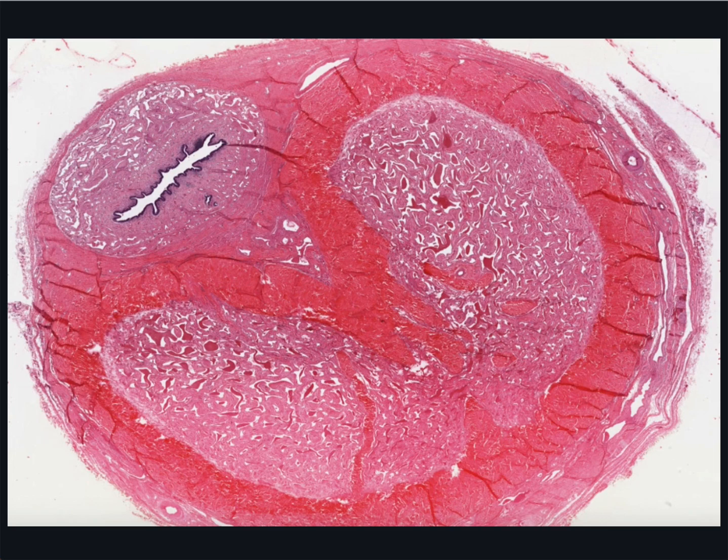Now here's a section through the male urethra. We're going to look at the penis in more detail in the lecture on the male reproductive system. Its reproductive function is much more interesting than its urinary function. Only the urethra concerns us at the moment.